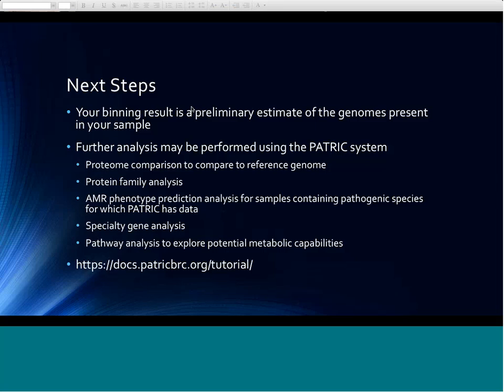Okay. There's always a chance that an assembled genome will be chimeric in nature. Does PATRIC check for chimera in genomes? The consistency analysis will often recognize the fact that you've got inconsistent functional roles within the same genome. Right. And I think actually one of Bruce's examples could be thought of as a result of a chimeric assembly, I'm guessing. The example where it looks like a Bacteroides contig snuck into the Odoribacter? In order to sneak in there, it had to have Odoribacter signatures in that contig. Yeah.